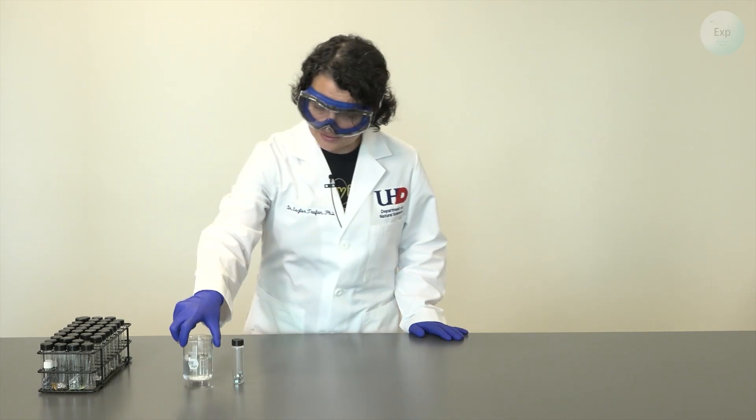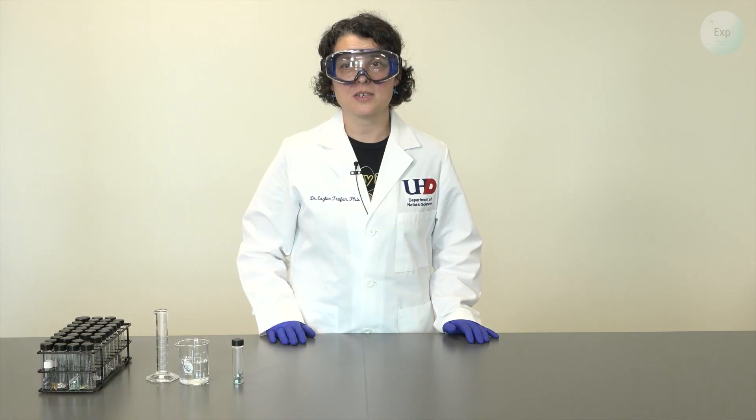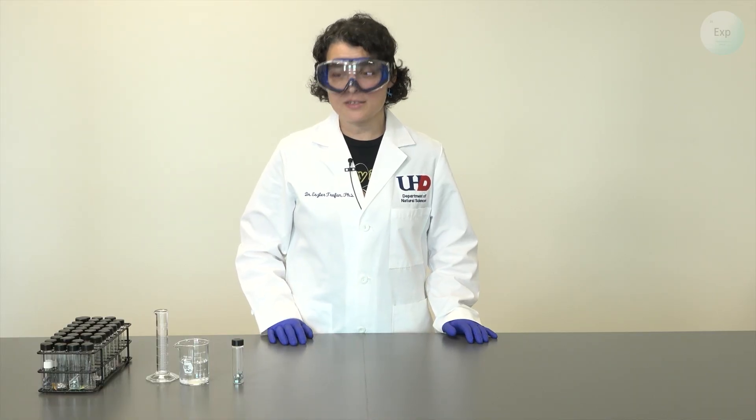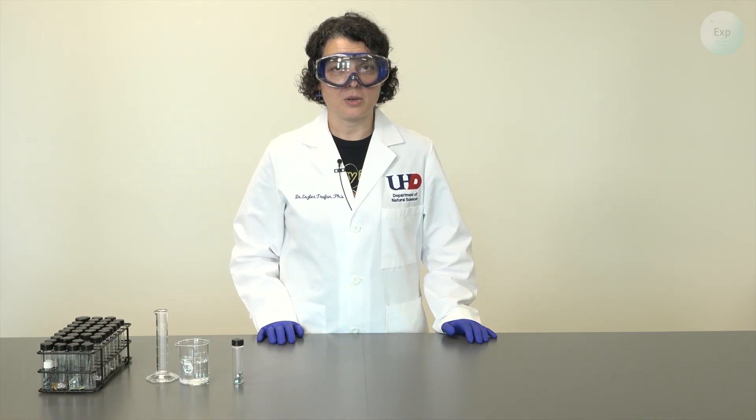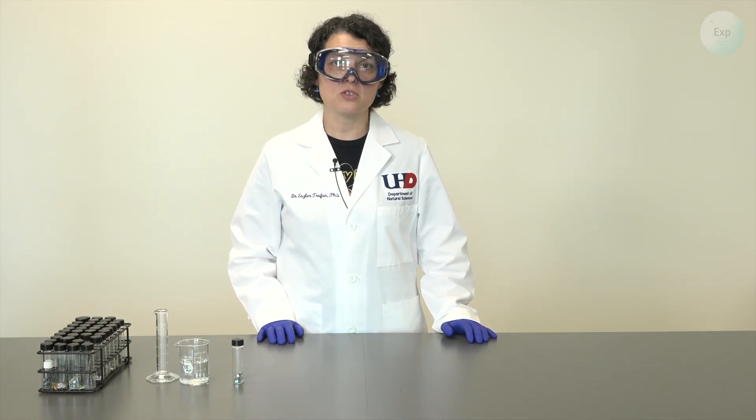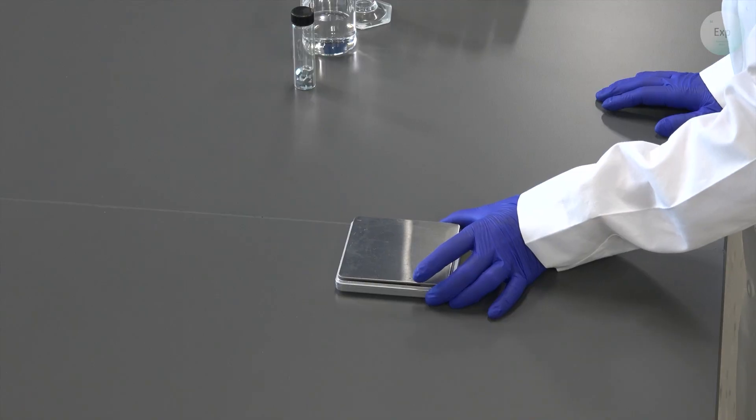So I will need some water for my measurement and a graduated cylinder so I may determine the volume of the water before I dunk my items in it and after. For density we are going to determine the volume and we also need to determine mass. For mass I am going to use a scale. Let's get started.